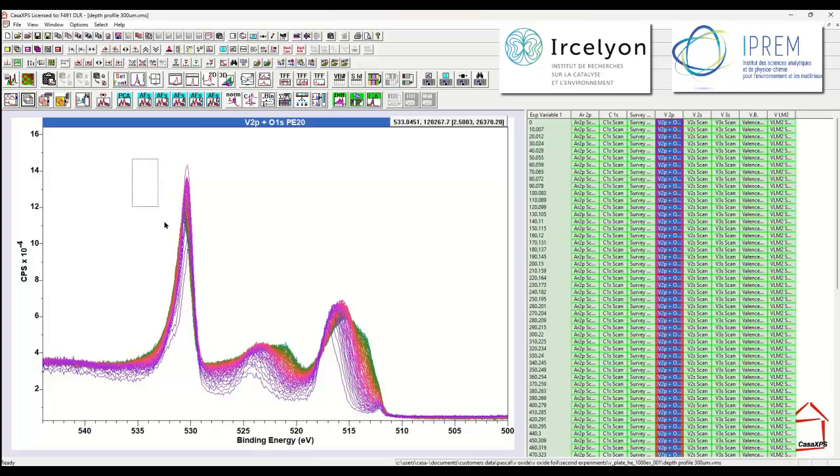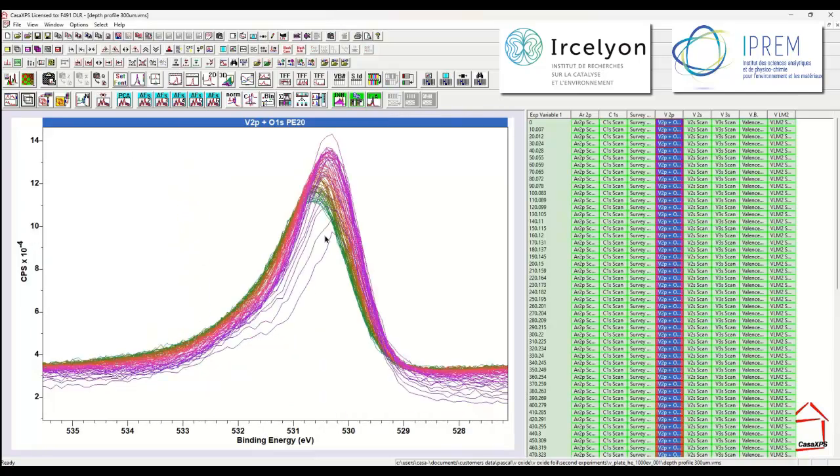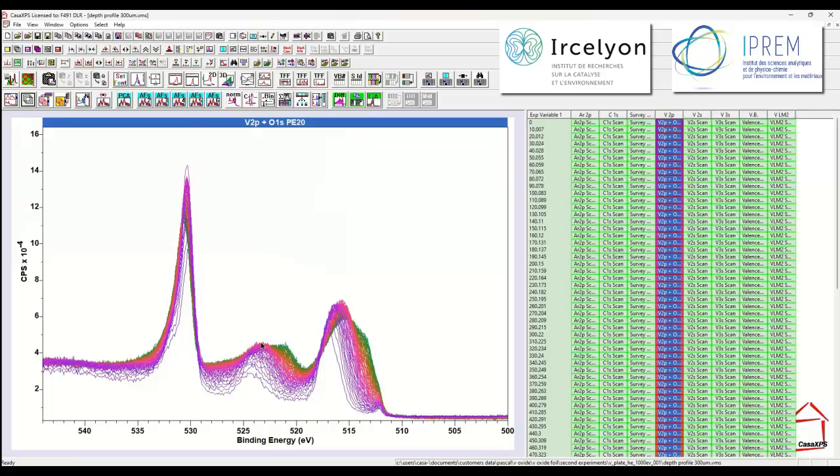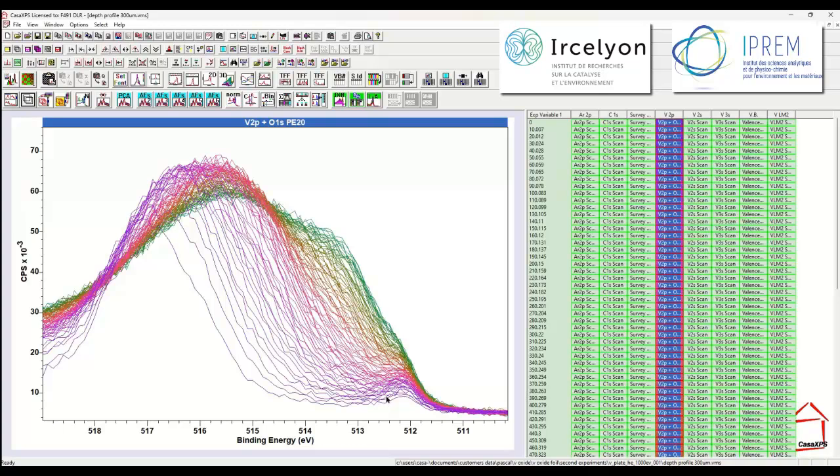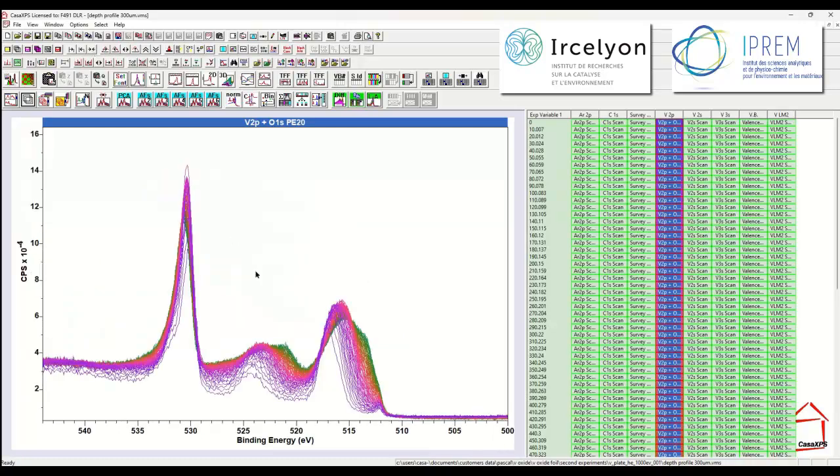There's clearly a change in the oxygen peak. This is the oxygen 1S. And we can also see a significant change in the oxide. This is the vanadium 2P3 halves oxide peak. Not quite so obvious, but this is a small peak that might well be a metallic form of vanadium. And that doesn't appear to change. So there's lots of evidence in these data that we are seeing genuine chemistry alteration as a consequence of hitting the surface with these helium ions.